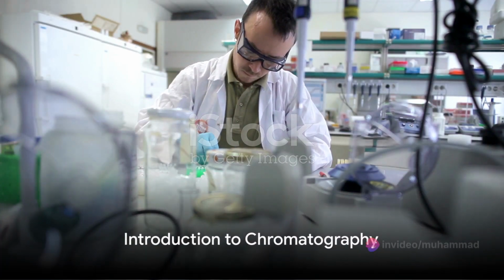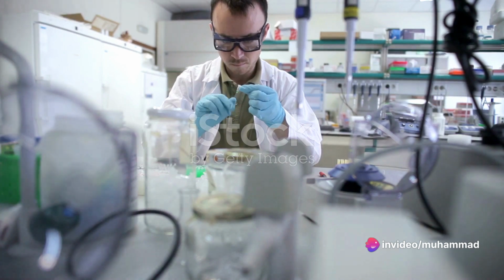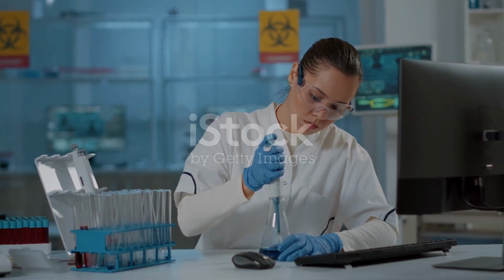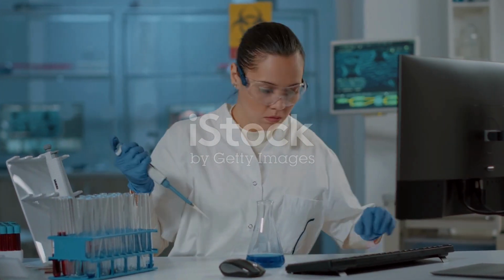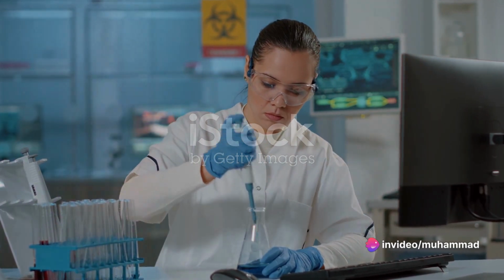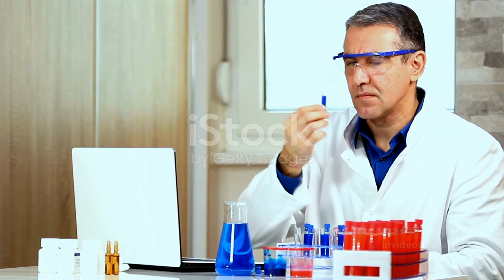Have you ever wondered how scientists separate mixtures into their individual components? Allow me to introduce you to the fascinating world of chromatography, a technique that does exactly that. Chromatography is like a magical sieve that filters out the components of a mixture one by one, helping us to see what's really inside. But this isn't just a high school science experiment.